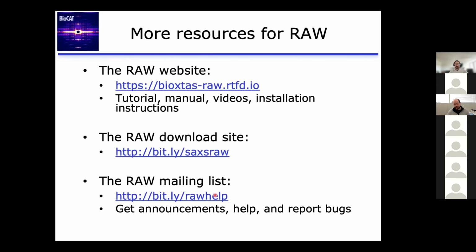You can also do contrast matching in SAXS with protein DNA. Lois Pollock's group has done this quite successfully using sucrose, but that gets a little messy. You can actually have the sucrose kind of caramelizing in the X-ray beam. But there's a lot of different tricks for doing these kinds of things. Typically, though, for a complex like that, I'd recommend starting with SAXS. And if you can't see what you want to see, the SAXS at least gives you good preliminary data to expand out to SANS experiments, which are much more competitive for getting beam time.